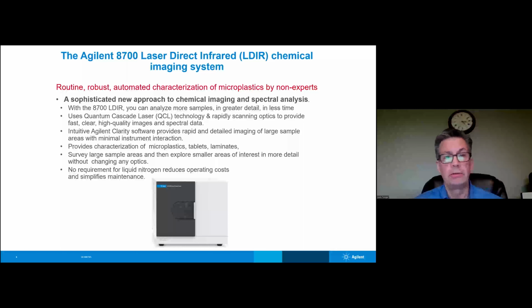Now, some of the traditional operations that are required would be locating the sample. You might use a joystick or something. You might have to change magnification, requiring rotating the turret, manually adjusting focus, and so on, adding liquid nitrogen, like I've already mentioned. All these things require some kind of technique. The person really needs to be trained in using the overall instrumentation in order to collect high quality data.